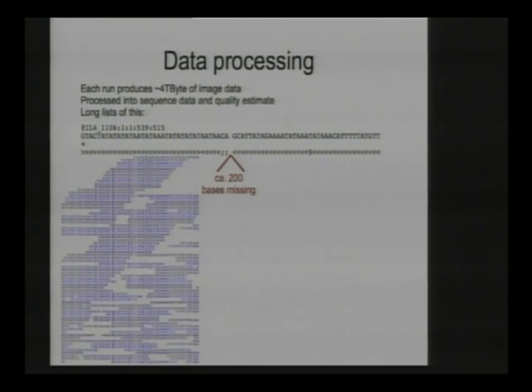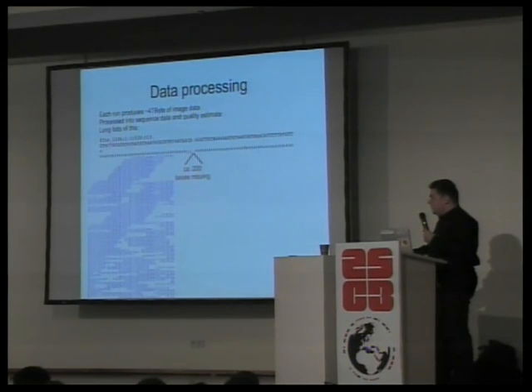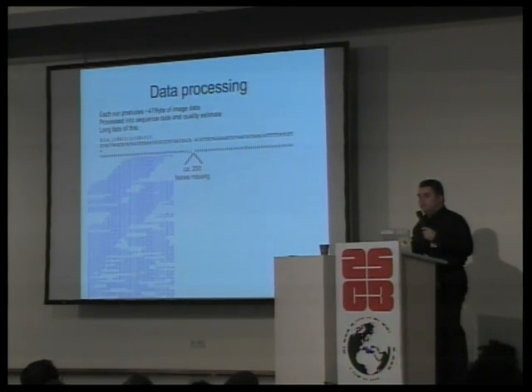So it's quite a bag of reads. And this is what they look like in a so-called alignment. As you can see, the bases in one column are always the same. It's a little hard to see probably. So everything here is a G, and these reads are aligned because there are multiple sequencing strands of the same original molecule. So this base here, for example, has been sequenced, I don't know, 20, 30 times in this process.